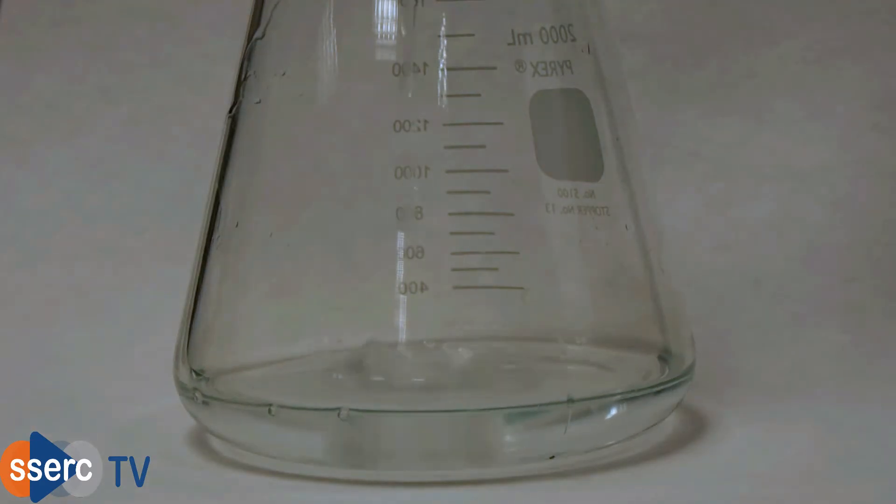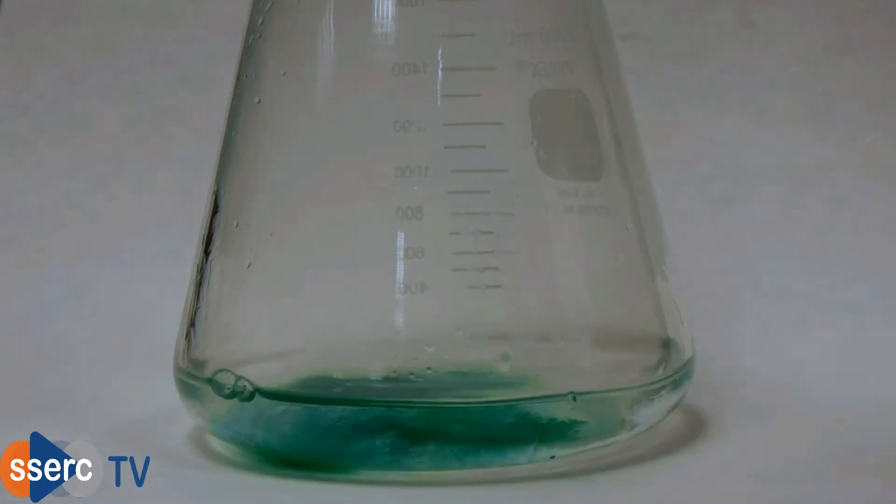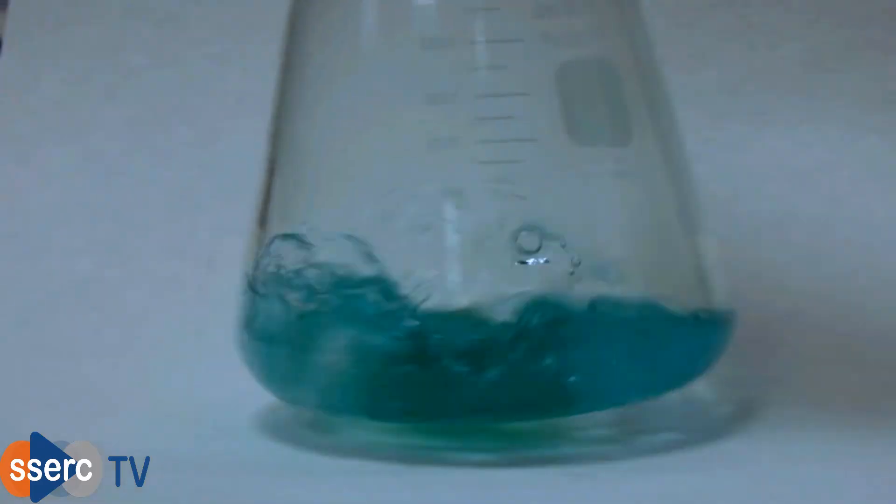We start off by taking a large flask and preparing a 1.2 molar solution of hydrochloric acid by diluting concentrated acid 10 to 1. To this we add some copper chloride and then swirl to dissolve.